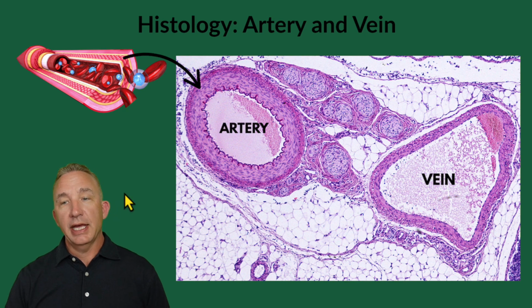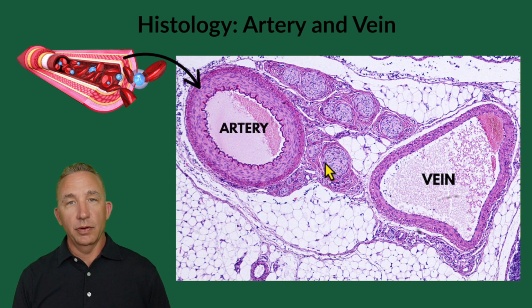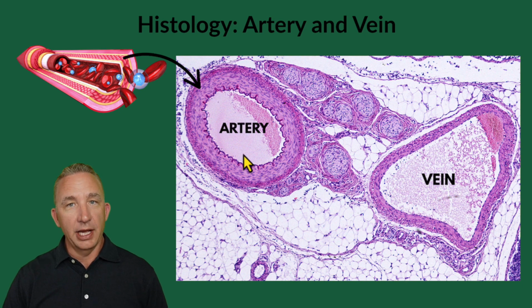And what we typically have is an artery and a vein that run together, along with, you can see some nervous tissue, so some of the nerve as well. So when we look at a cadaver, we tend to see that artery, veins, and nerves all run together. And sometimes their names are very similar because it's based on their functionality and where their landmarks are in the body. When we look at an artery versus a vein, an artery tends to hold its shape like a nice circle relative to a vein.